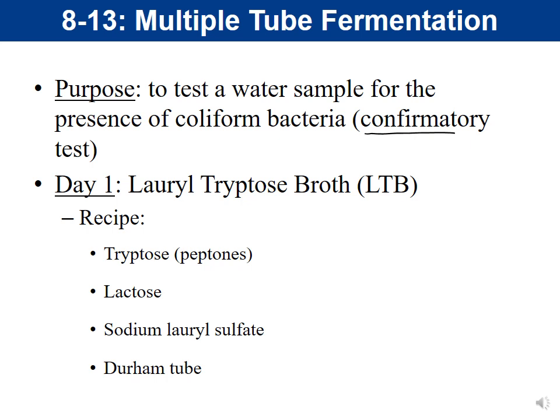So if we get a positive on the Endo agar and we get positive for coliforms on this multiple tube fermentation, well, then we can say with high confidence that in fact there are coliforms in that water sample. So notice the name is multiple tube fermentation, which means that this actually is going to span several days. There's several tubes that you have to inoculate in order for this test to be in fact confirmatory.